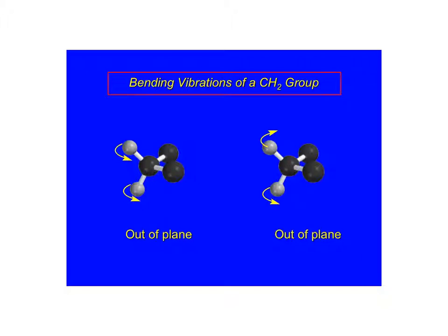We never had the opportunity to do IR anyway. We just bought our IR spectrophotometer this summer. So please don't break it. We actually have a nice one. It's a diamond IR.